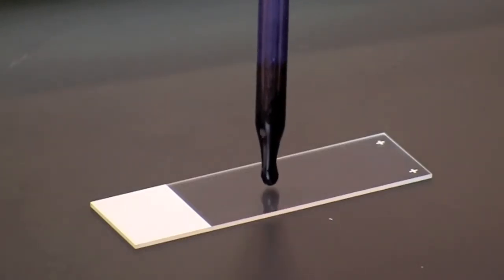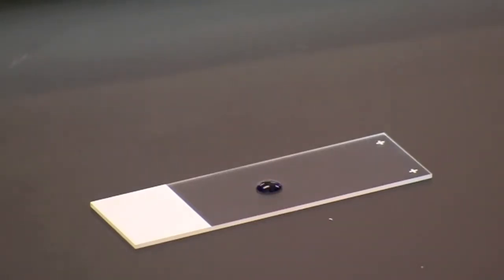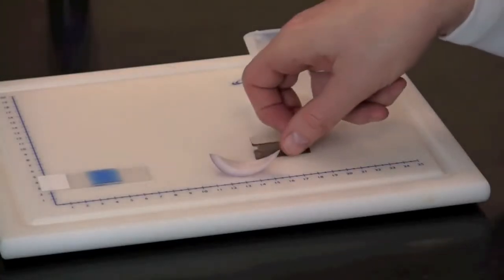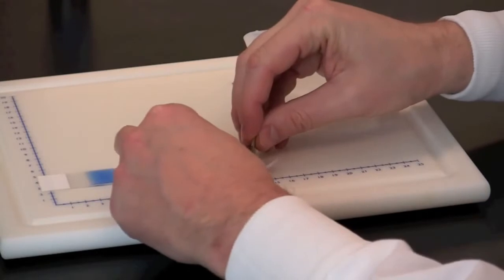To make a wet mount of onion cells, place a drop of fast blast DNA stain on a microscope slide. Take a small piece of onion.